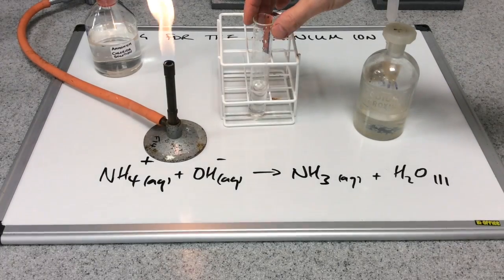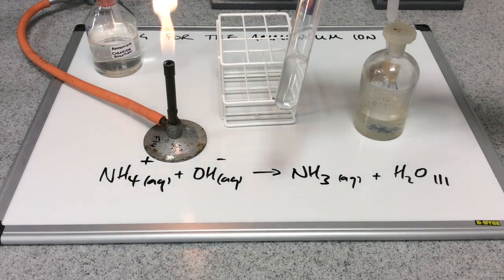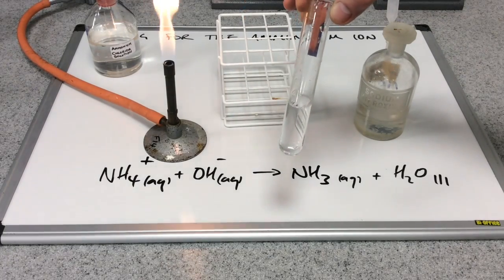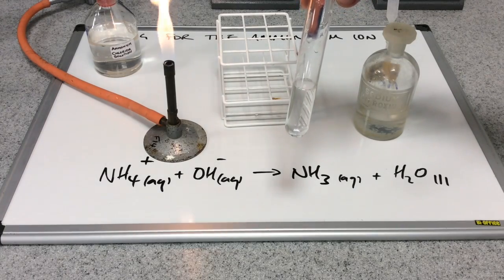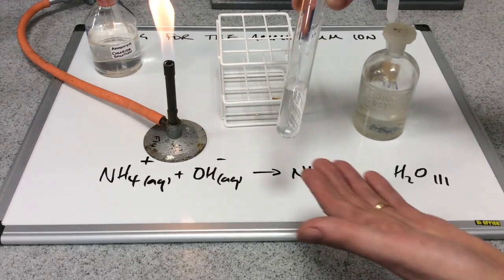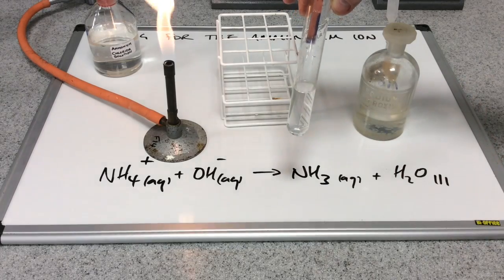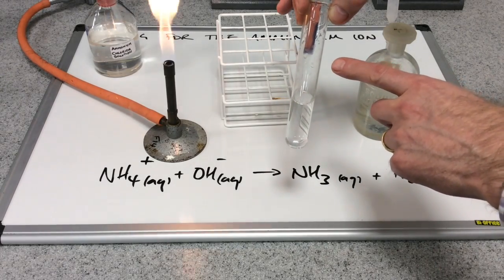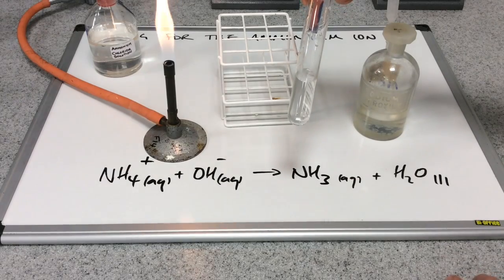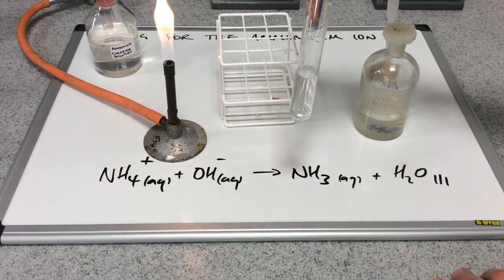I've finished heating now. I'll just show you the litmus paper so you can see it's going blue, and that's confirmation that ammonia was being produced by heating this solution. Ammonia is an alkaline gas and it turns red litmus paper or universal indicator paper blue.